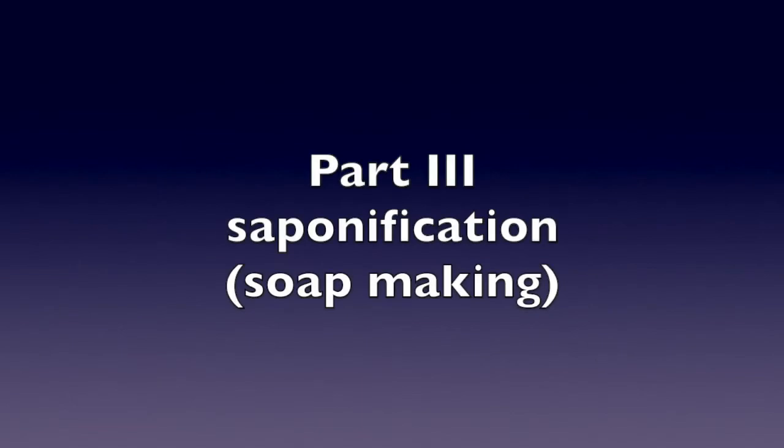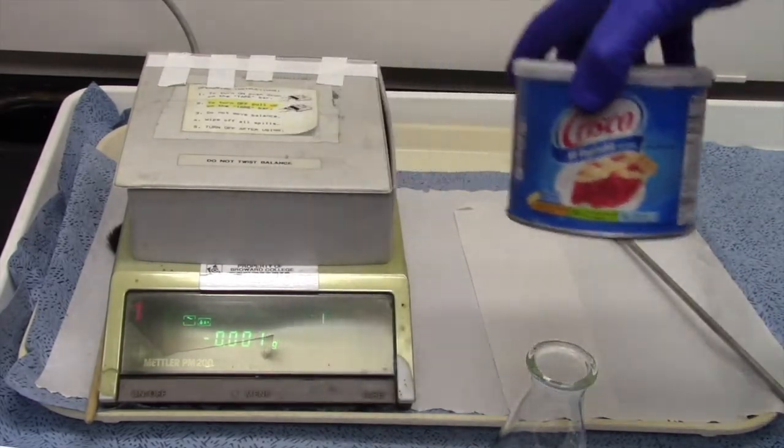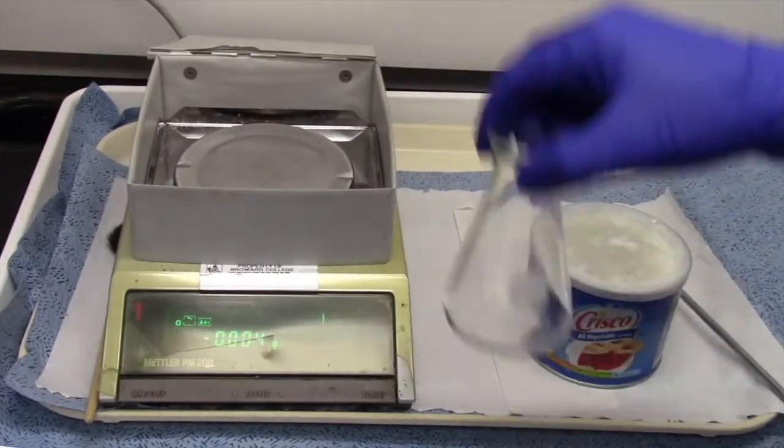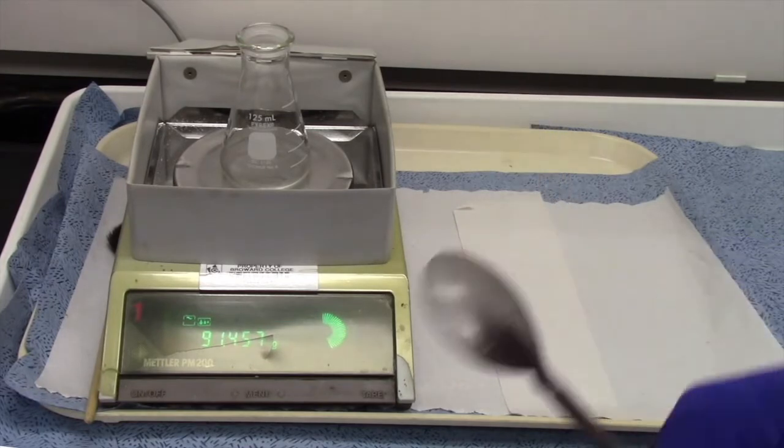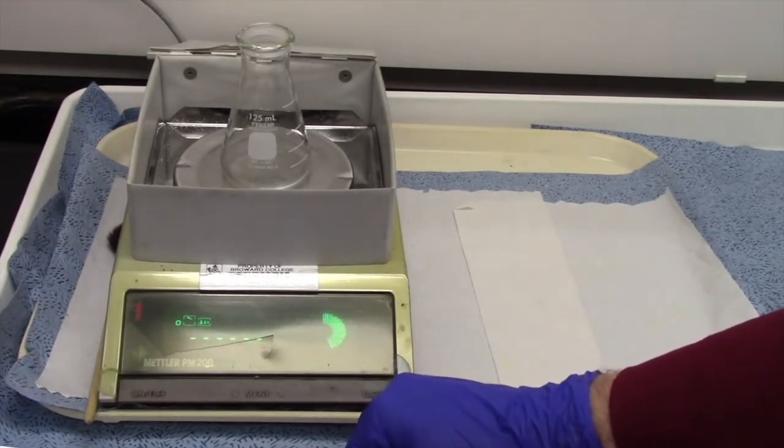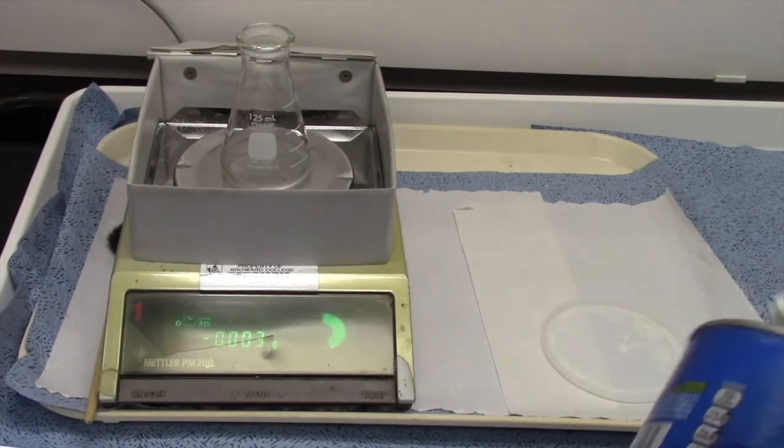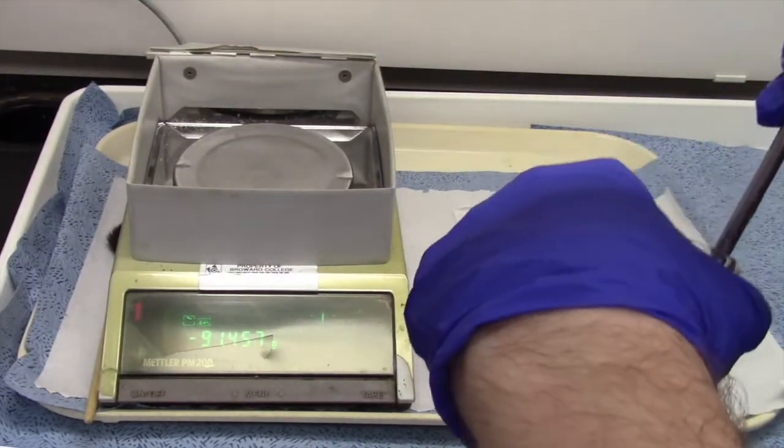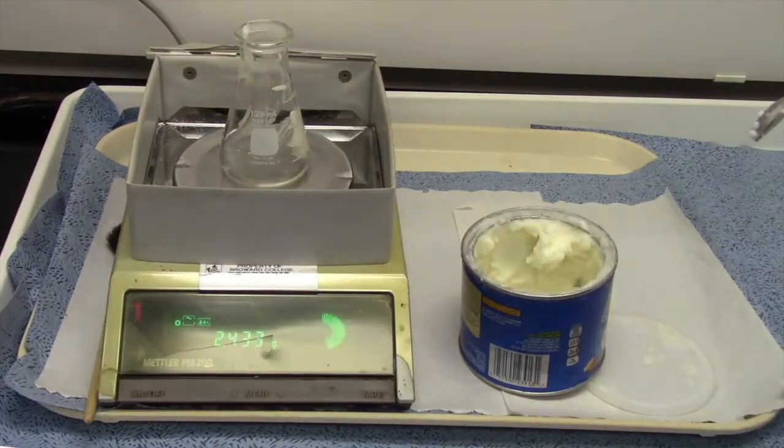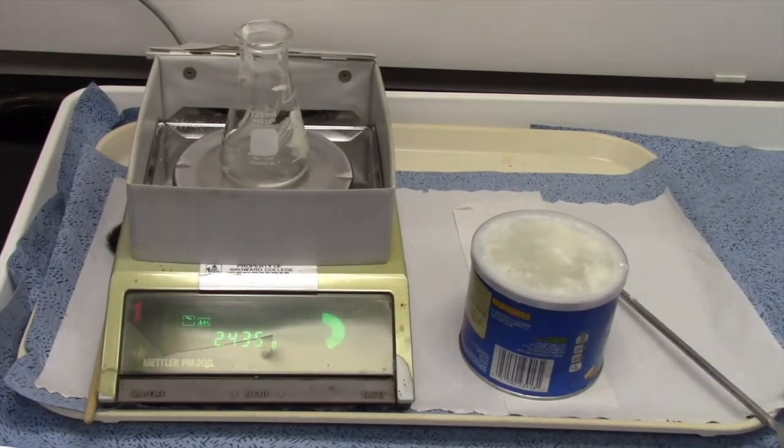Now we're going to weigh out 2.5 grams of this vegetable shortening, Crisco. You can buy that at any store here in Florida. I'm going to weigh directly into this Erlenmeyer flask because Crisco is really messy to work with. You're better off weighing directly into the flask. Two and a half grams doesn't take very much. 2.4, that's good enough. I'm very happy with that, so now we're going to move on to the next step.